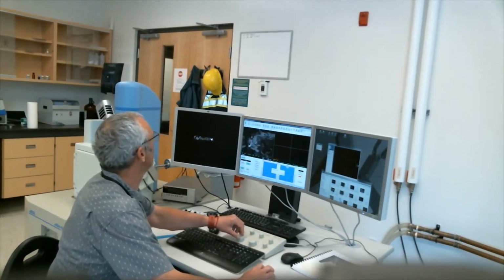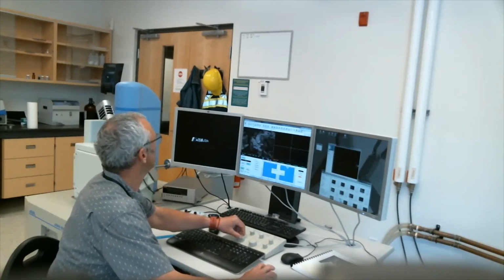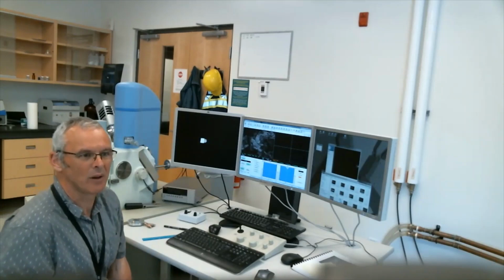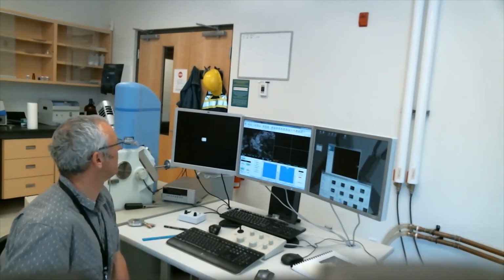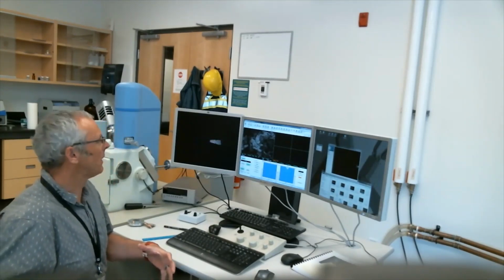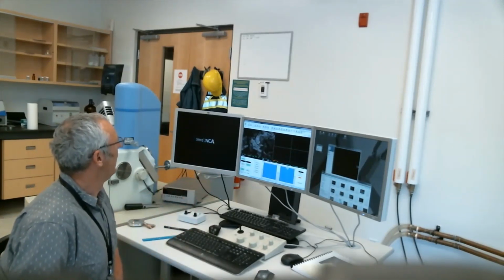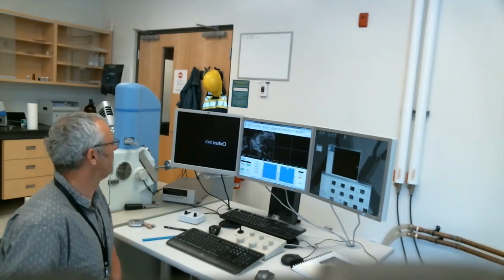What we're seeing now is a whole pile of, I don't know how well you can see this, I'll try to explain it as well as I can, a whole pile of rough feldspar crystals sitting on this surface. Okay? And you can see the topography.